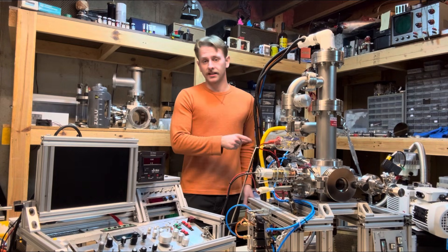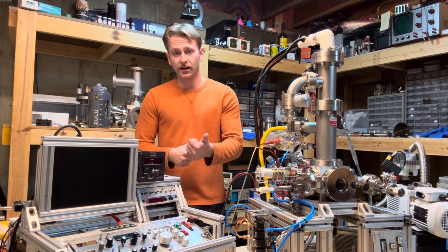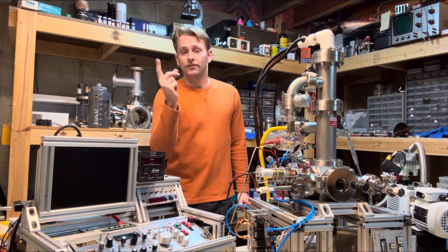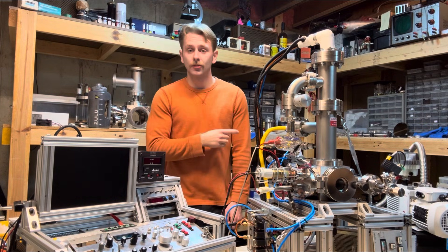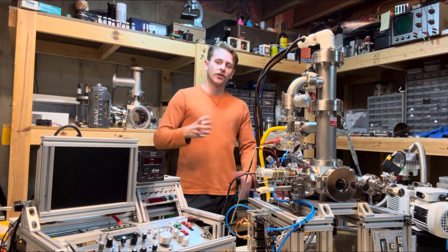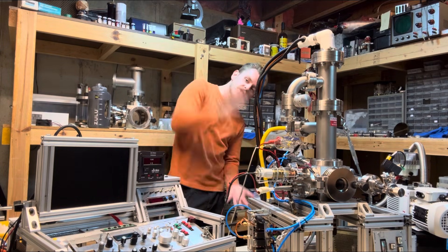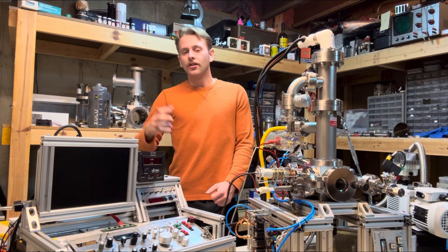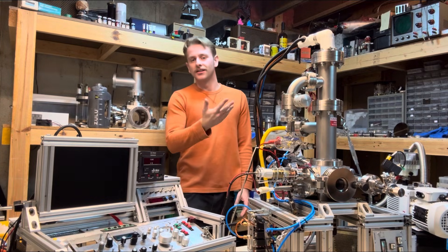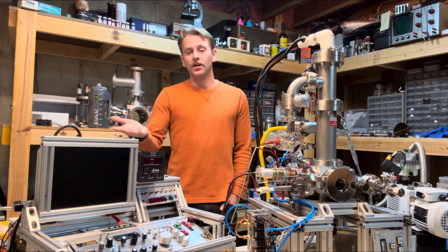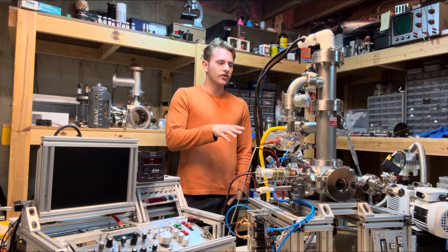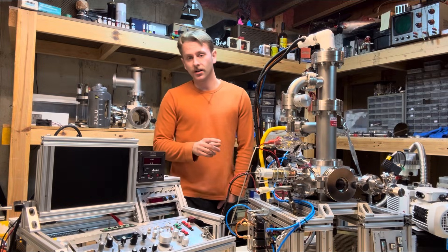And that's why I've got two pumps for this thing. I've got a regular pump, just a mechanical vacuum pump. You could imagine that I was dumping out a water bottle and there was still some little droplets on the wall. That's why I have a second pump, a turbo molecular pump, which is like a jet engine. It spins at 90,000 RPM and creates a massive pressure differential and just sucks those things right out of the chamber. But there's still some stuff in there. You just can't get it perfect.